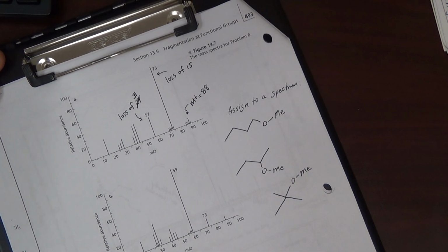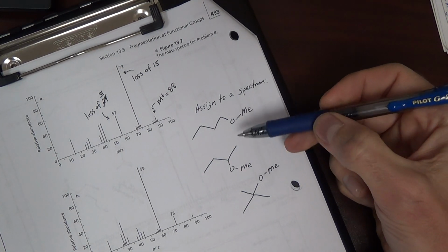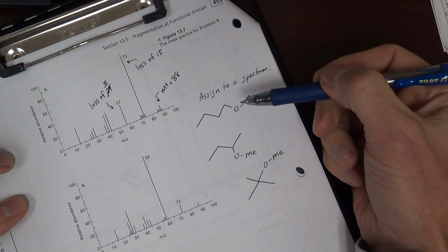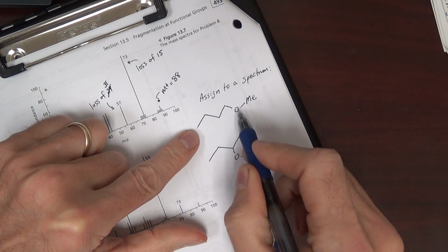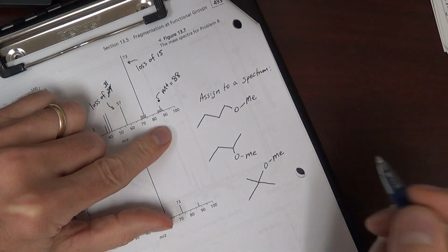Hi guys, let's look at this problem set in the Mass Spec handout. We have 3 different compounds and we need to assign each compound to its mass spectrum. Okay, first thing we would want to do here, as I recommended, is to predict what type of cleavage patterns we expect. What type of ions do we expect to form? Let's look at each one of these.